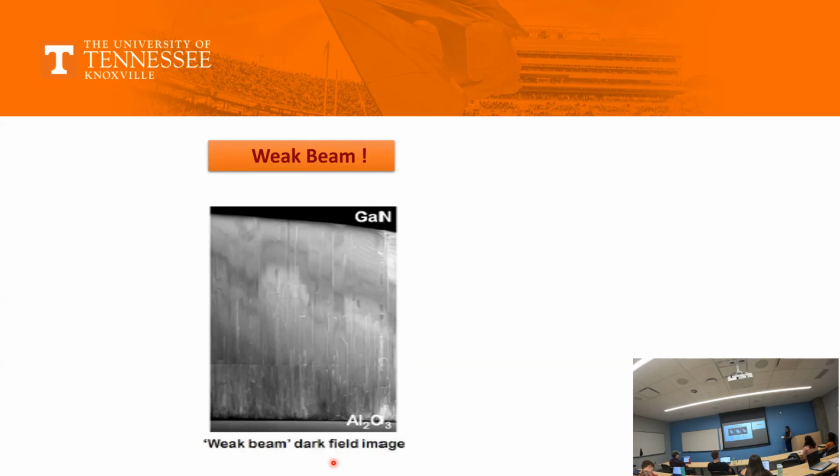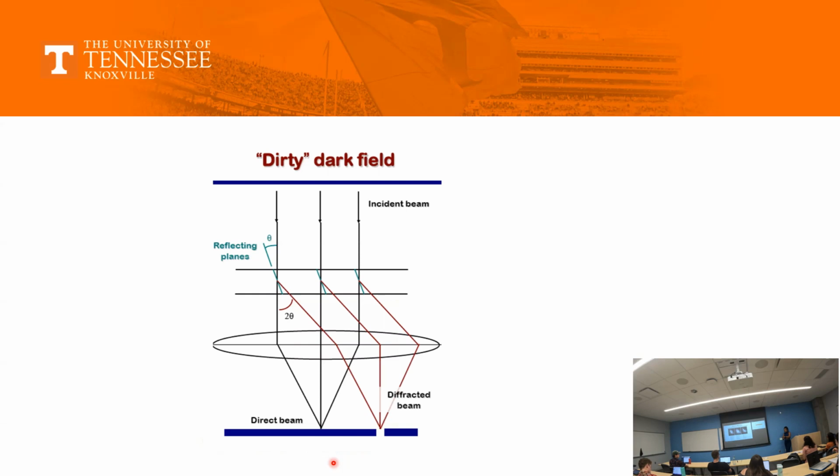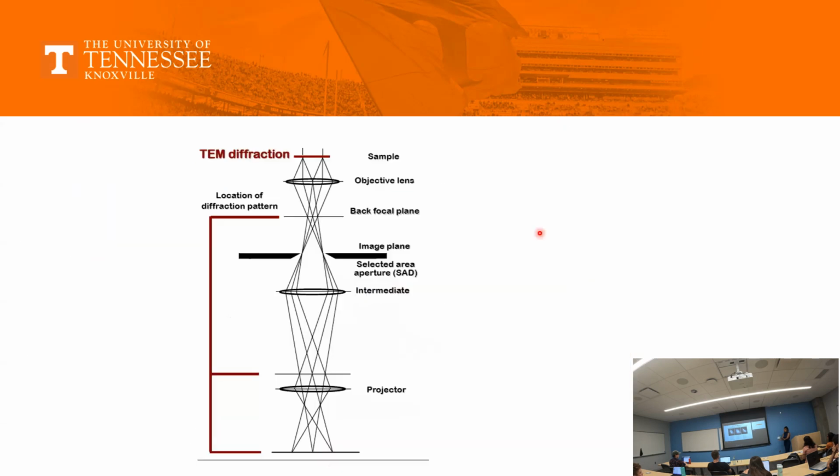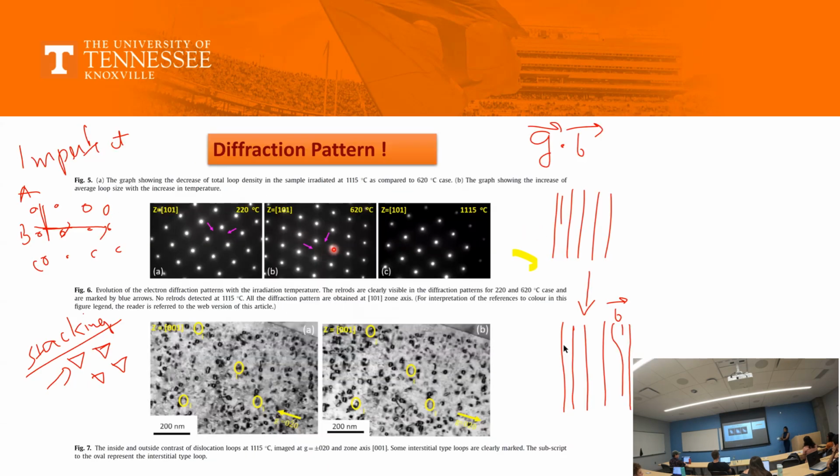Last time I told you. All these spots that I show you here in this image, if you start taking a higher order, all these are the diffraction spots on the zone axis. In this one, you can check any, and you will have a very good image.